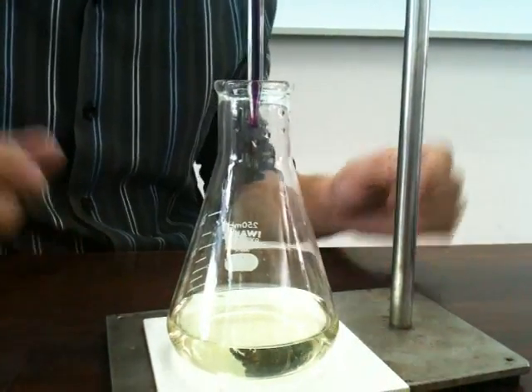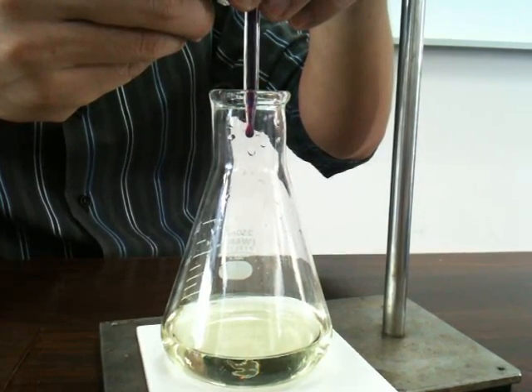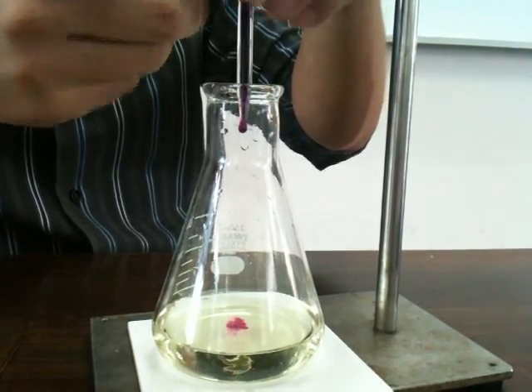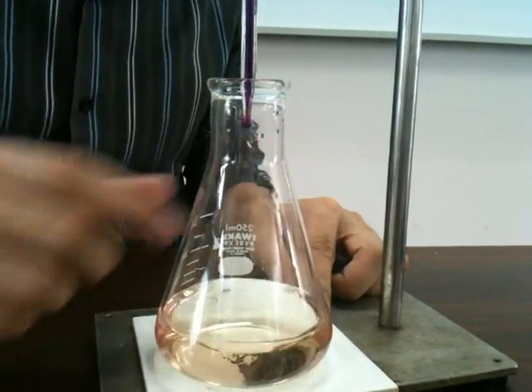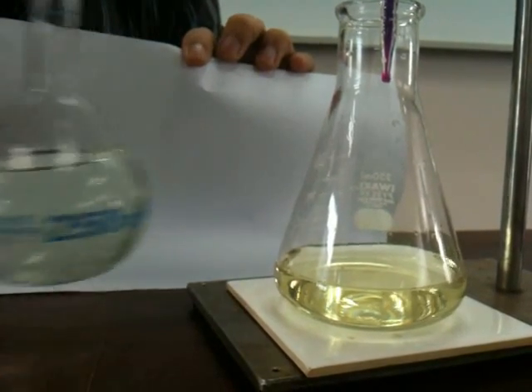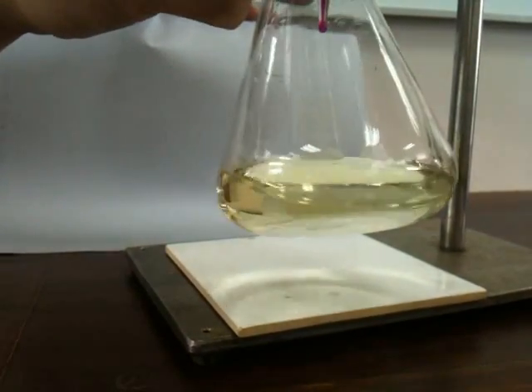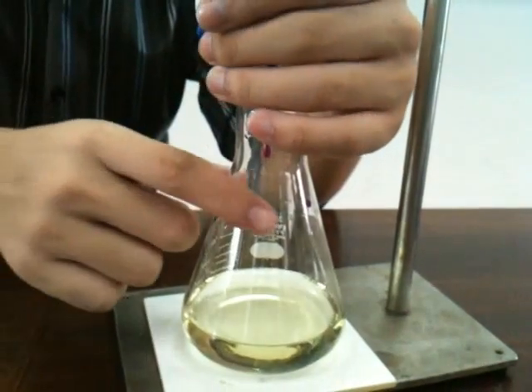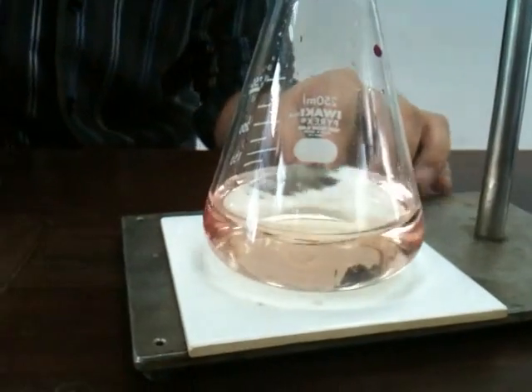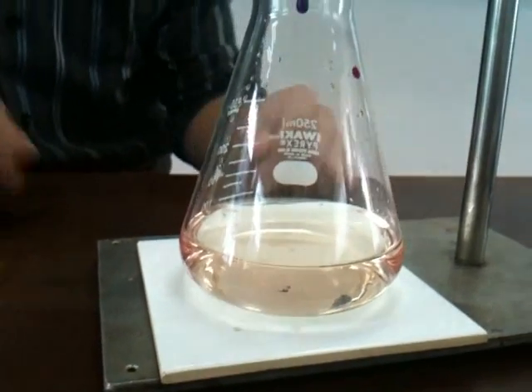The colour is still green at this point — add another drop. The colour has changed. You'll notice that the solution is more intensely coloured than before. Previously it was light green and it may appear as a yellowish green now, just before the end point. Add another drop, give it a shake, and you'll find that the colour is different — it's closer to an orange. And this is your end point.